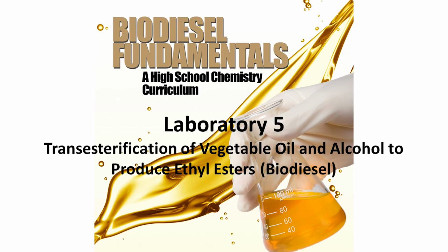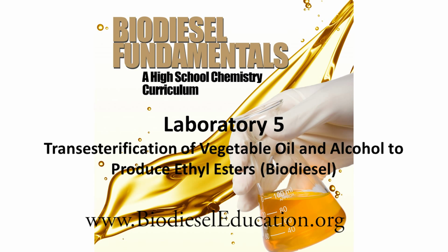This is the fifth in a series of 8 chemistry labs on the fundamentals of biodiesel. In this lab, we will learn about transesterification of vegetable oil and alcohol to produce ethyl biodiesel. Written procedures and background information for all 8 labs is provided on the Biodiesel Education website.